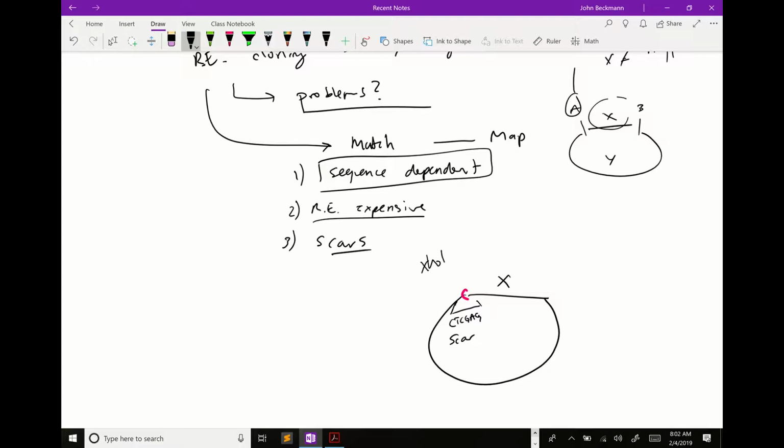And imagine sometimes you need to do restriction enzyme cloning of two genes fused together. If you need to fuse X and Y together with a restriction enzyme site, now you've actually added in two codons, CTC, GAG. I don't know what those code for, but you've added them.